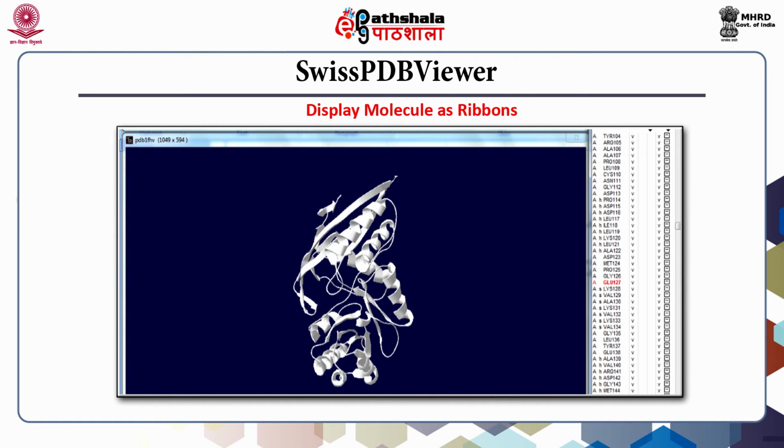Press Shift key with a click in the first column to unmark so as to hide all the residues. Now, no residue is displayed. However, at this stage, we can display the whole molecule in ribbon form by pressing Shift key with a click in the fifth column. This will display the ribbons, that is molecule as ribbons. However, all the ribbons appear in white color.